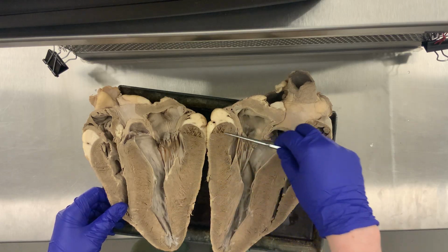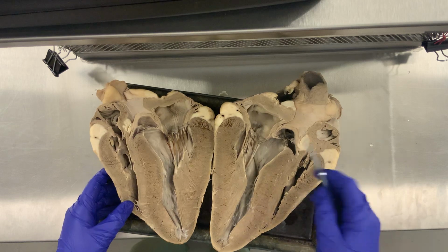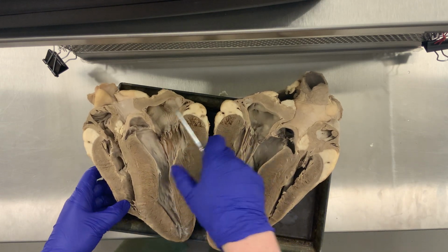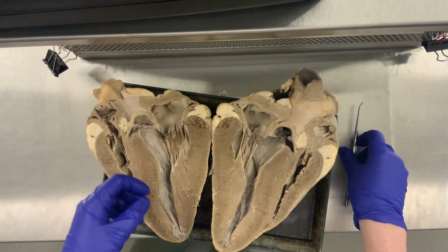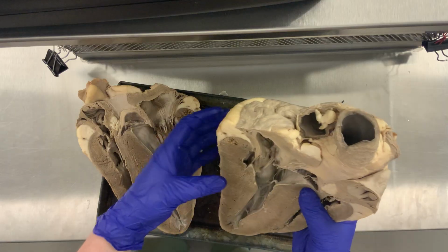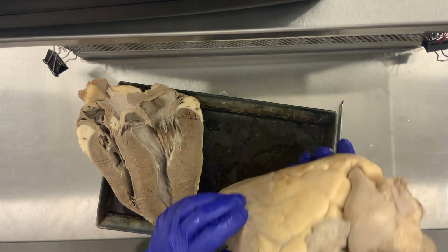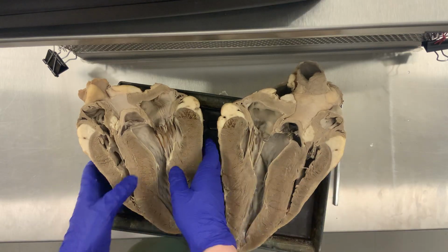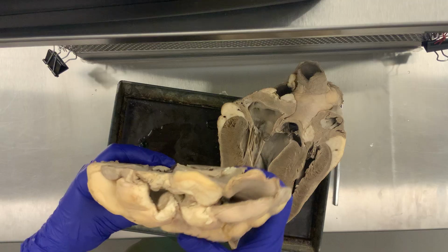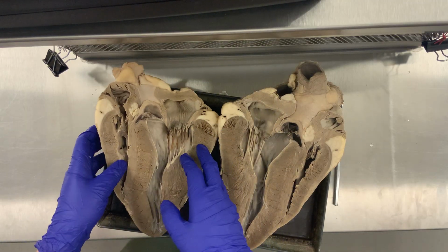And over here, this is also going to be the left side, as they're going to be mirrored when they close. This is to keep up the blood pressure when the blood is pumping out of the left ventricle. When you hold this side up to yourself and keep what you know to be the left side on your left, you can see that this is going to be the anterior of the heart. And if you hold this one up and keep the left side on your left, this is going to be the posterior of the heart. That's going to be helpful when you are looking for certain vessels.